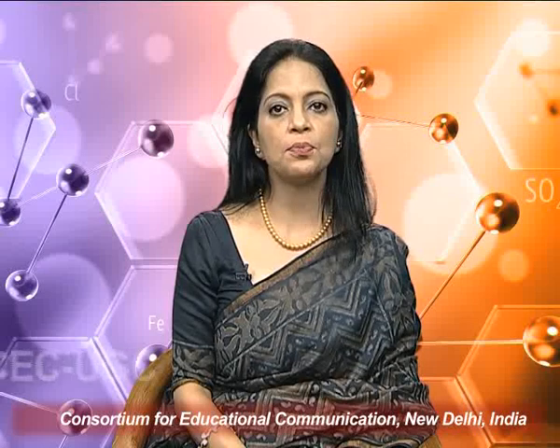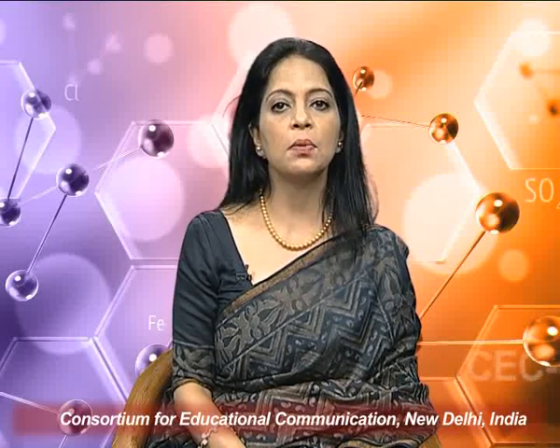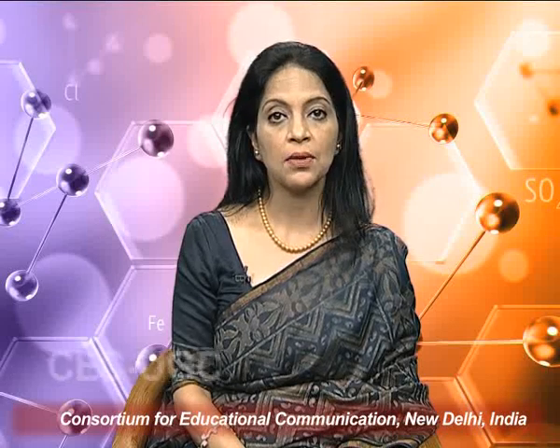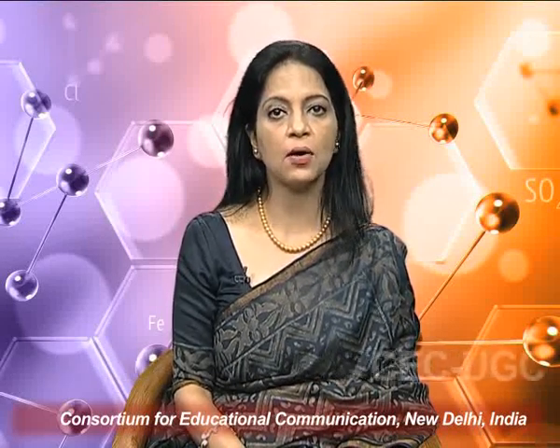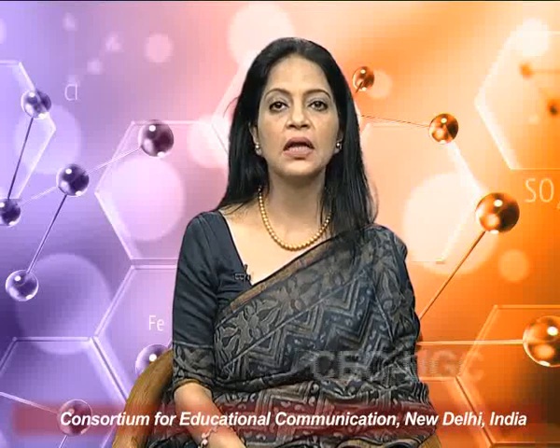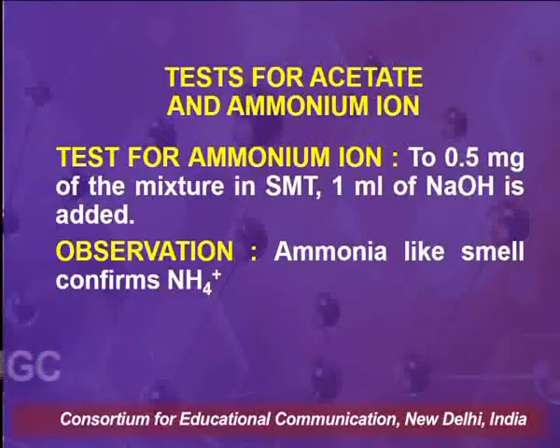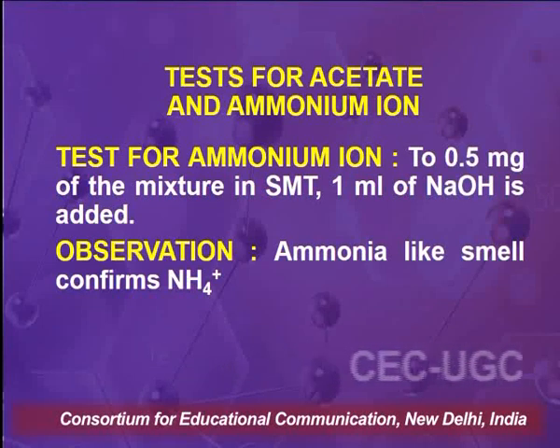So as we proceed with the analysis, there are so many fumes in the laboratory that it becomes difficult to identify these ions later, because of the number of smells due to the number of reactions being carried out. Hence acetate and ammonium ions need to be detected by their smell test in the very beginning of mixture analysis.